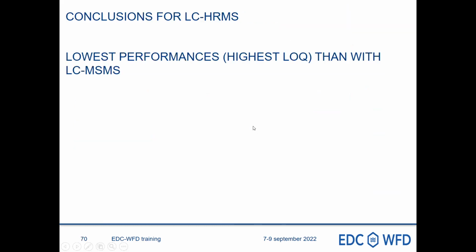And our conclusion, and it is in fact the only key message we would like to share with you: HRMS, in our sense, is not the solution to overpass. Really, the best strategy for a robust LOQ is the triple quad approach. This is our background experience within the project.